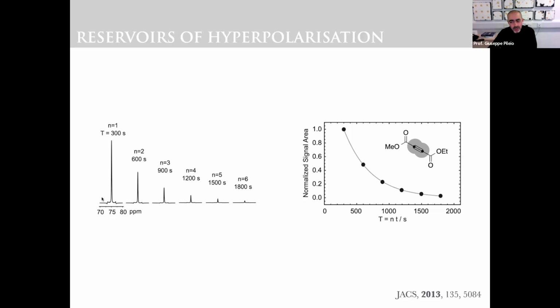Now, you clearly understand that even the very first spectrum here wouldn't be there if you used conventional methods. If you store the hyperpolarized magnetization as longitudinal order, because the T1 was 44 seconds, after 5 minutes you nearly have nothing. So here is a method to preserve this for as long as many minutes, in fact hours, with those intelligently designed molecules.